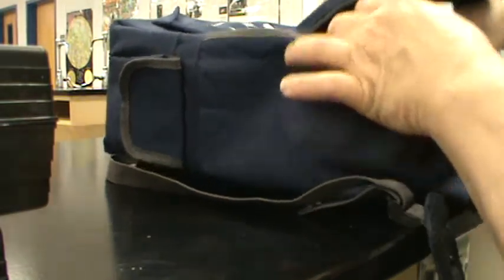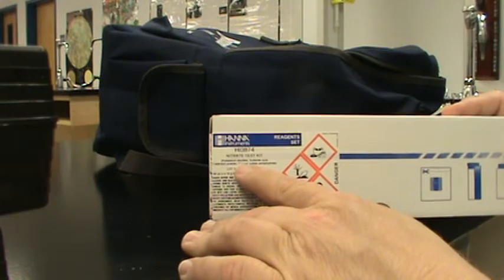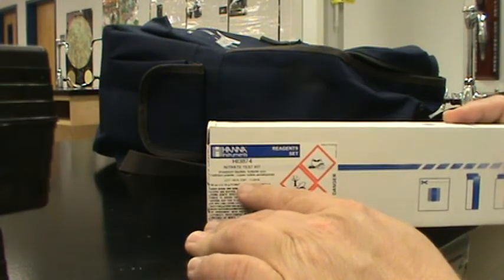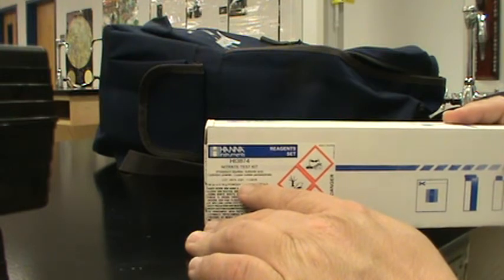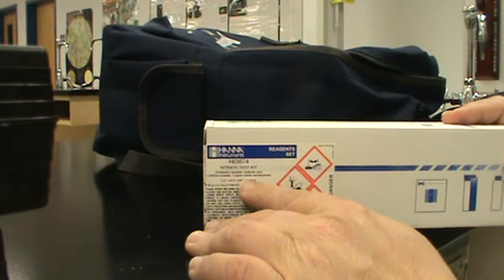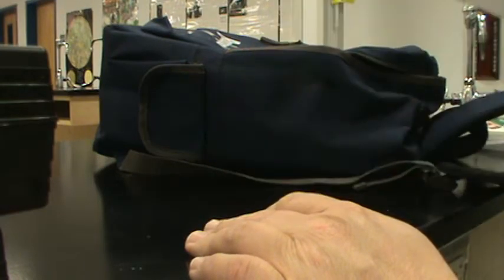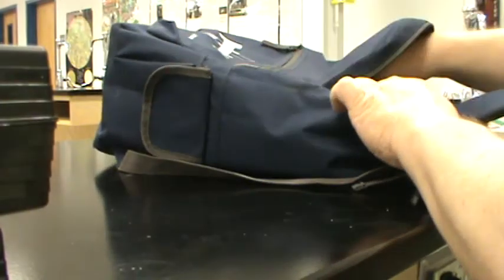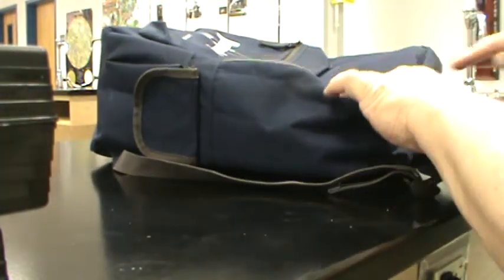And the final test that we will do is a nitrate test. There are naturally occurring nitrates and phosphates, but we see this in runoff from agricultural applications, farms, feedlots, dairies, any place where human agriculture is interacting with the environment. And finally, we've got some buffer solution to help clean our instruments when we're done.